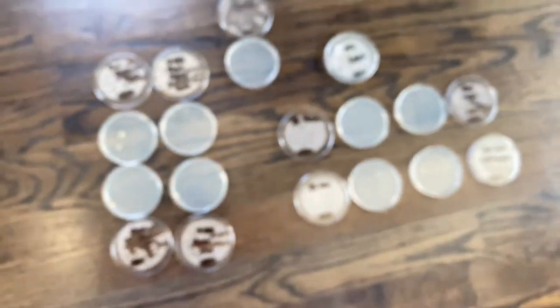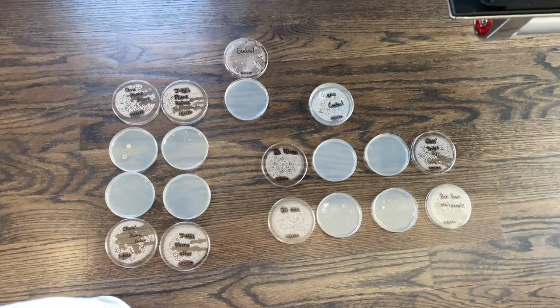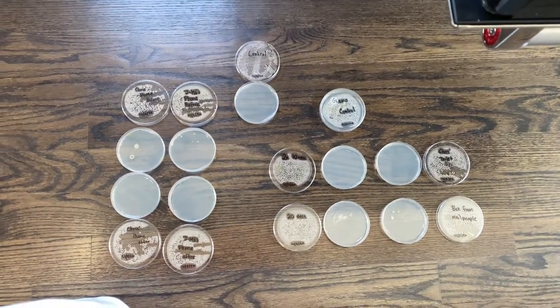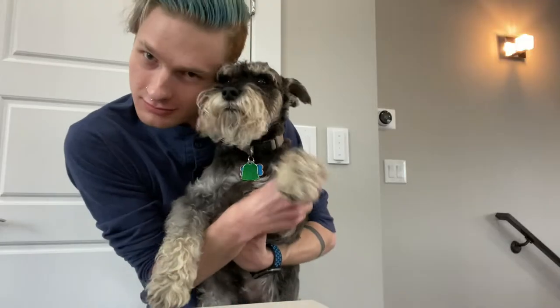And with that we are all done. It was interesting to see what was super germy and what wasn't, as well as seeing that as long as you wash your hands for 20 seconds, it seems like you'll get 99.99% of those germs off. Wash your hands and your pup often. Thank you so much for watching. Have a great day.